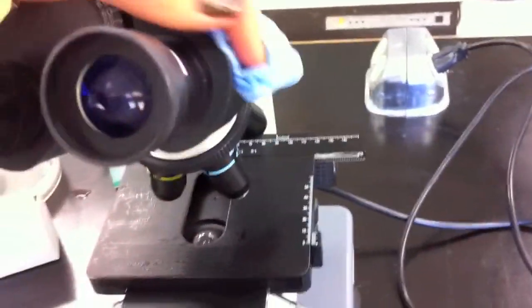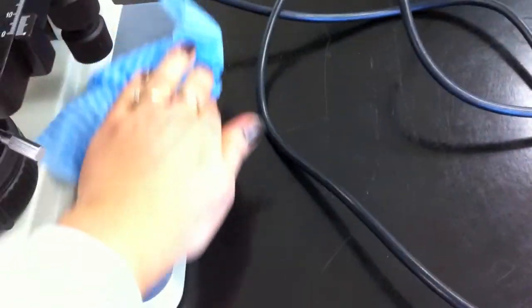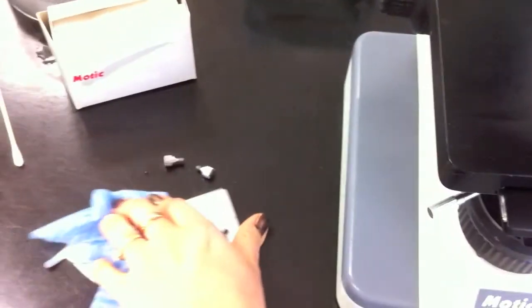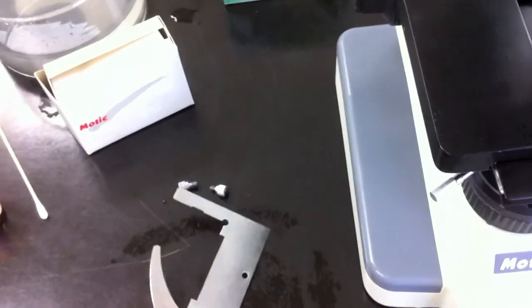Next we're going to clean the body of the microscope. We'll give the clip a nice wipe as well, both sides.